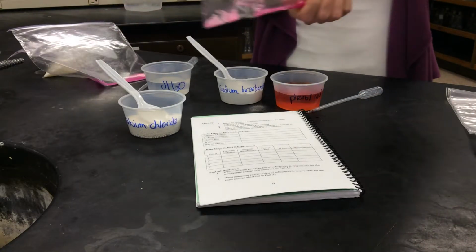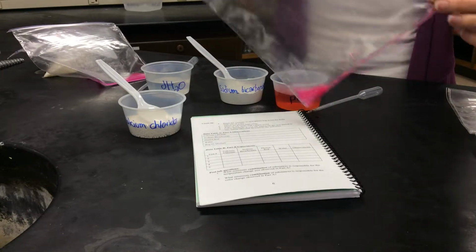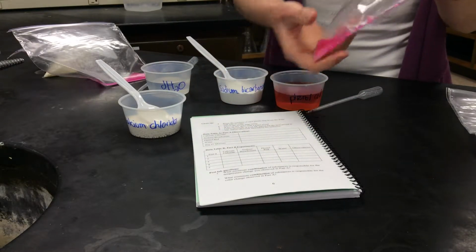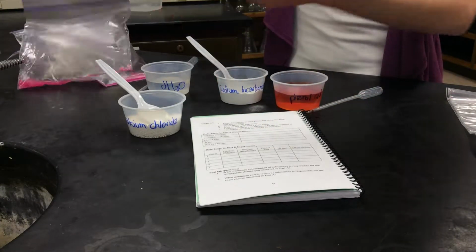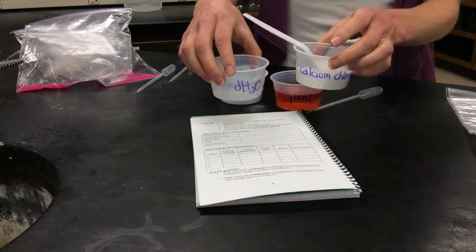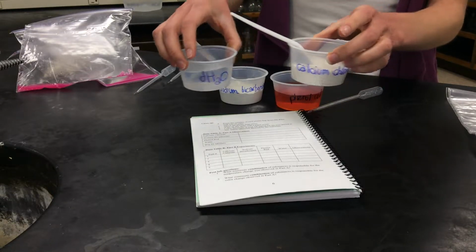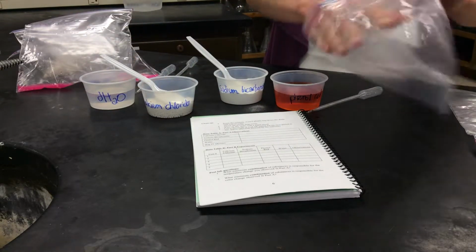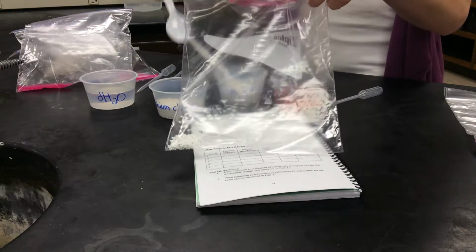So back to this one, we know that calcium chloride has something to do with the temperature change. But we want to figure out if it is the phenol red or the water that is needed to make that temperature change happen. Okay, I don't have phenol red by itself, but I do have water alone. So I'm now going to try calcium chloride and water and see if the temperature still changes. If it does, we'll know that all you need is calcium chloride and water in order to make that temperature change. So let's try calcium chloride and water.